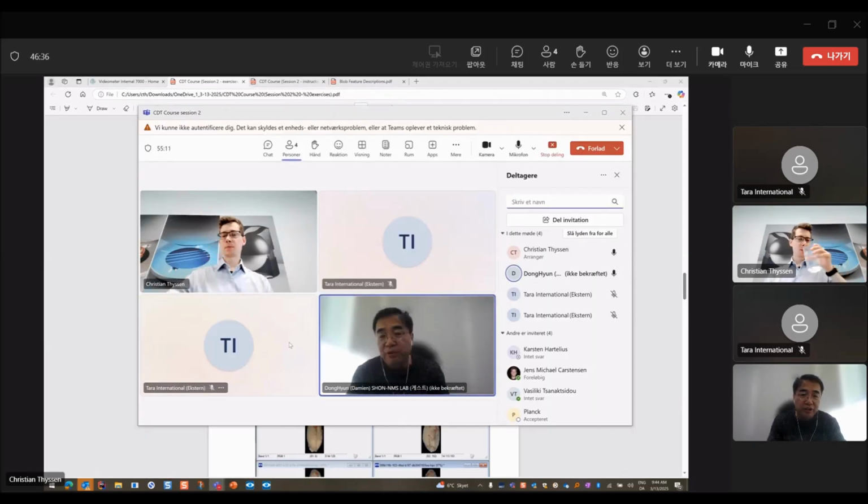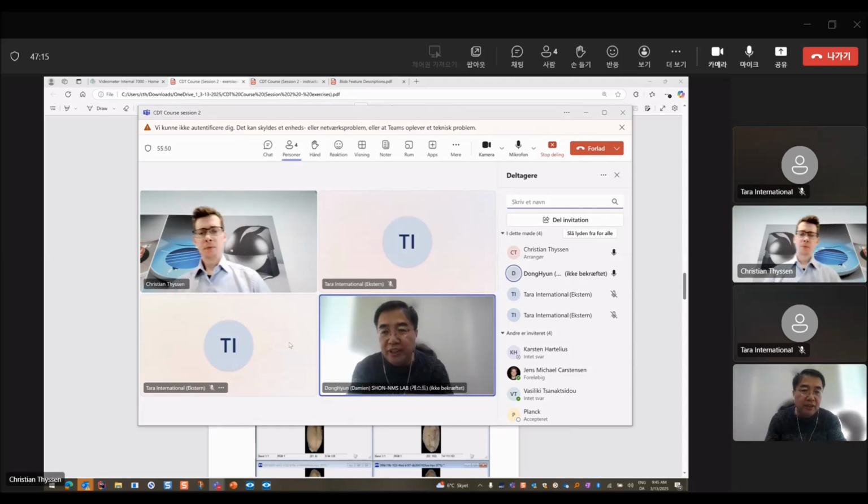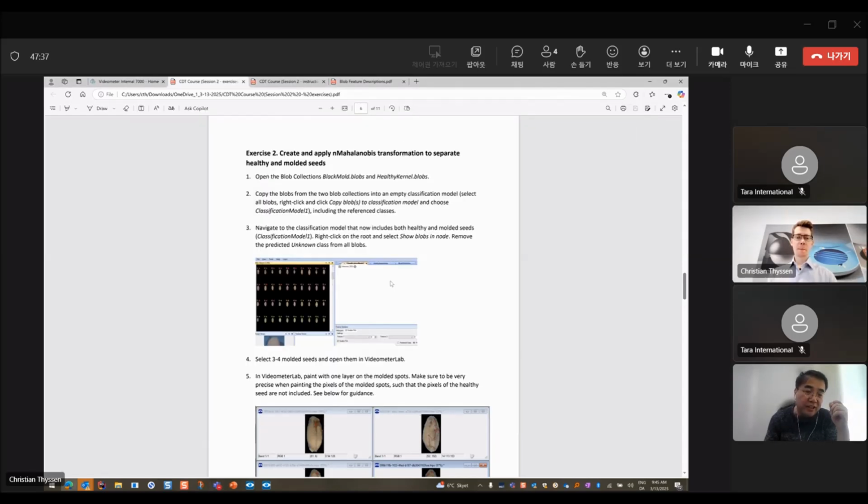I just follow your instructions, and then I wanted to do it myself, because sometimes it's a time-consuming procedure. I guess so. What I recommend is, if you already did exercise 1, you can do exercise 2. And if you have questions now, then you can share the screen. I pre-studied exercises 1 and 2, but I didn't finish, so I just want to know how you do exercise 2, and get your tips.